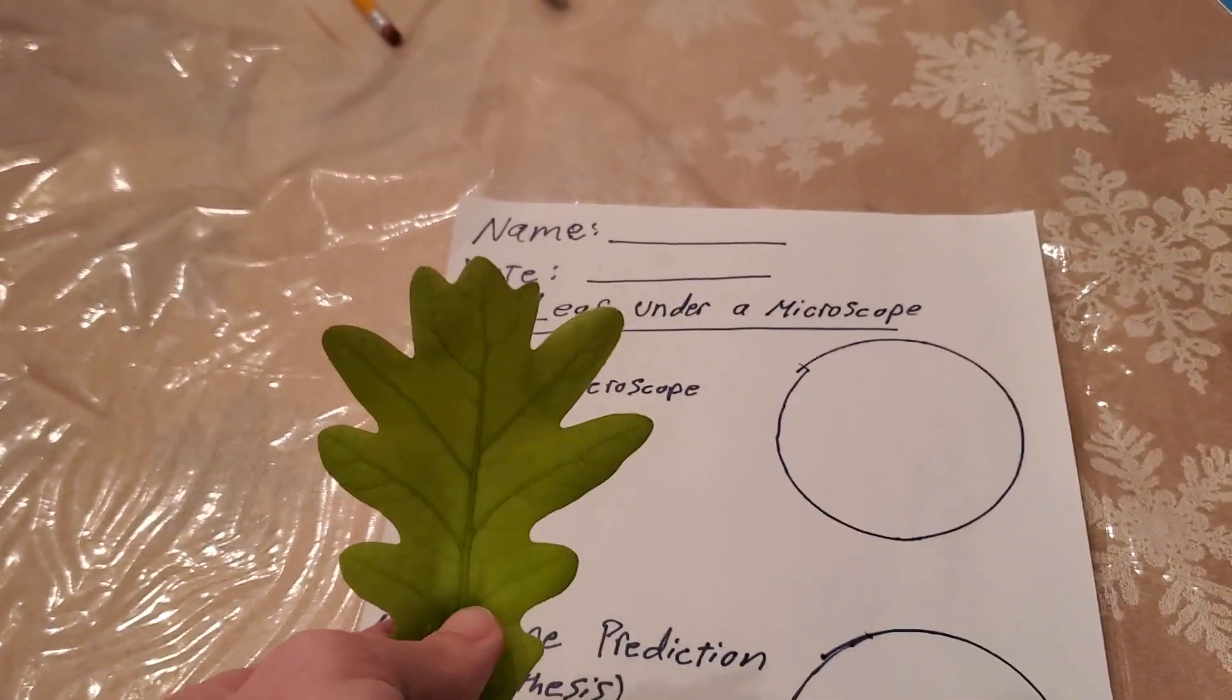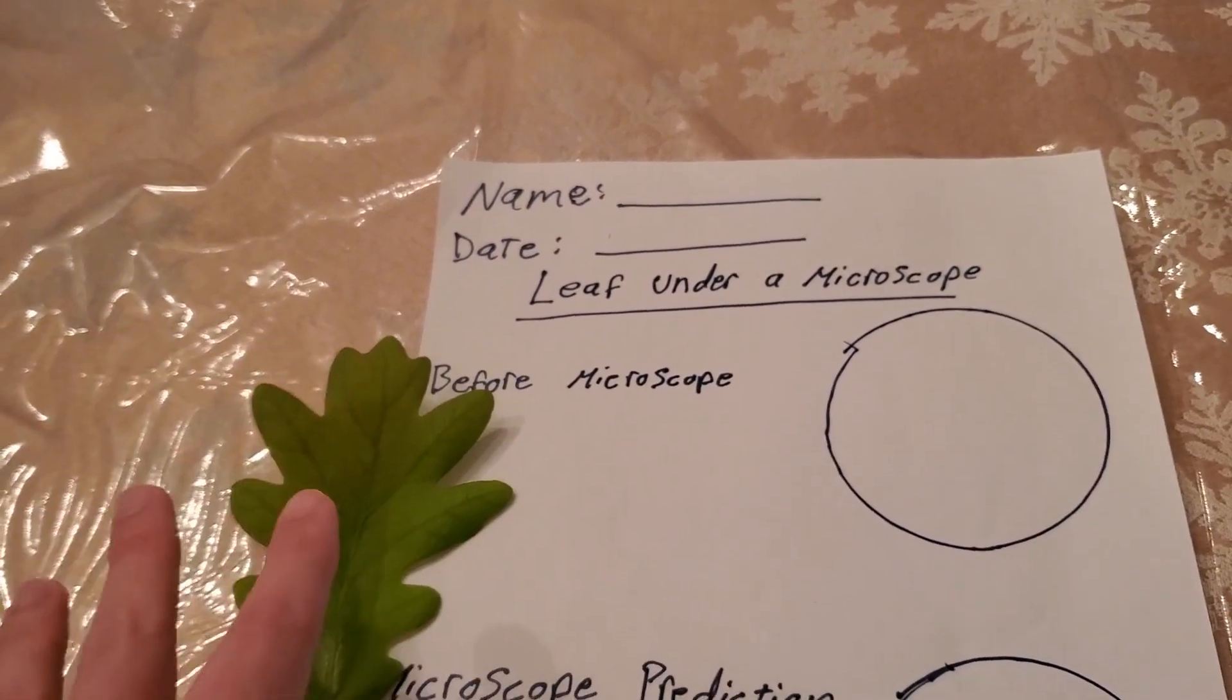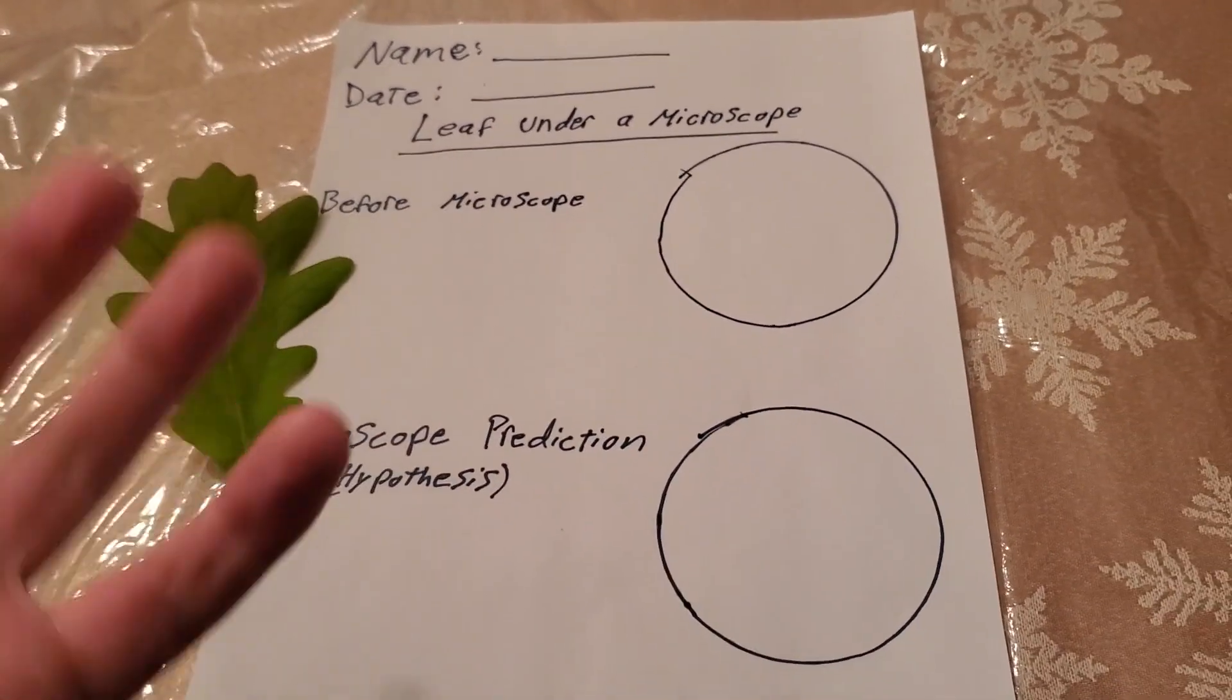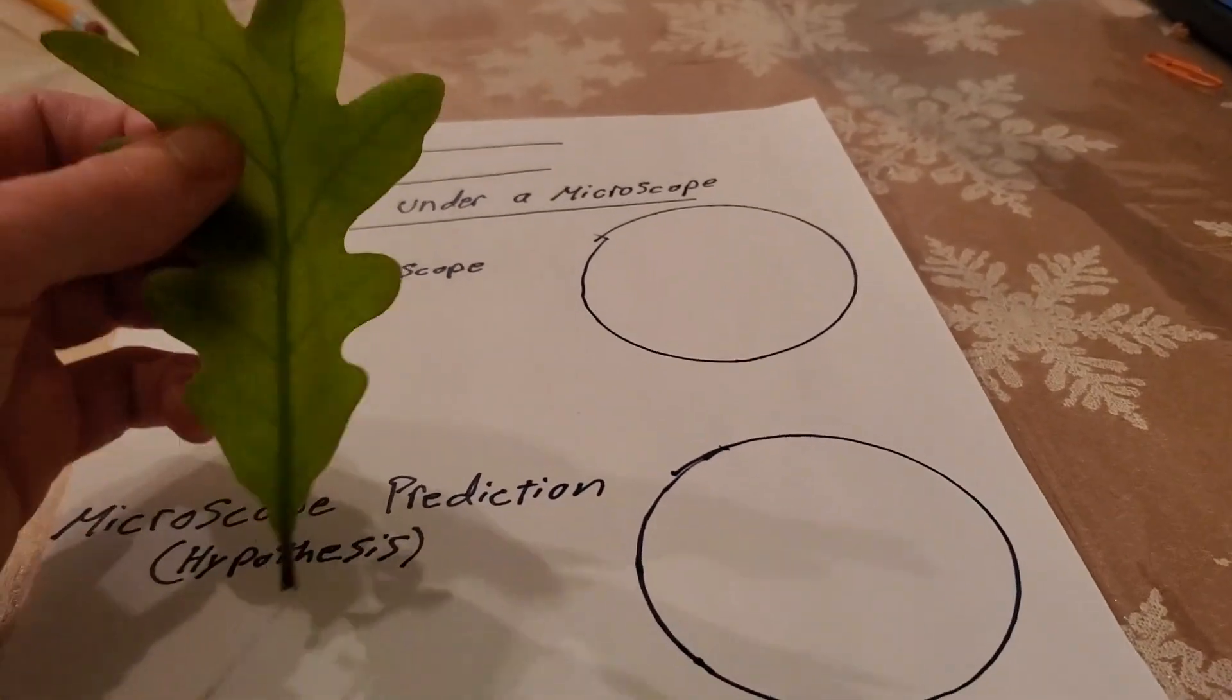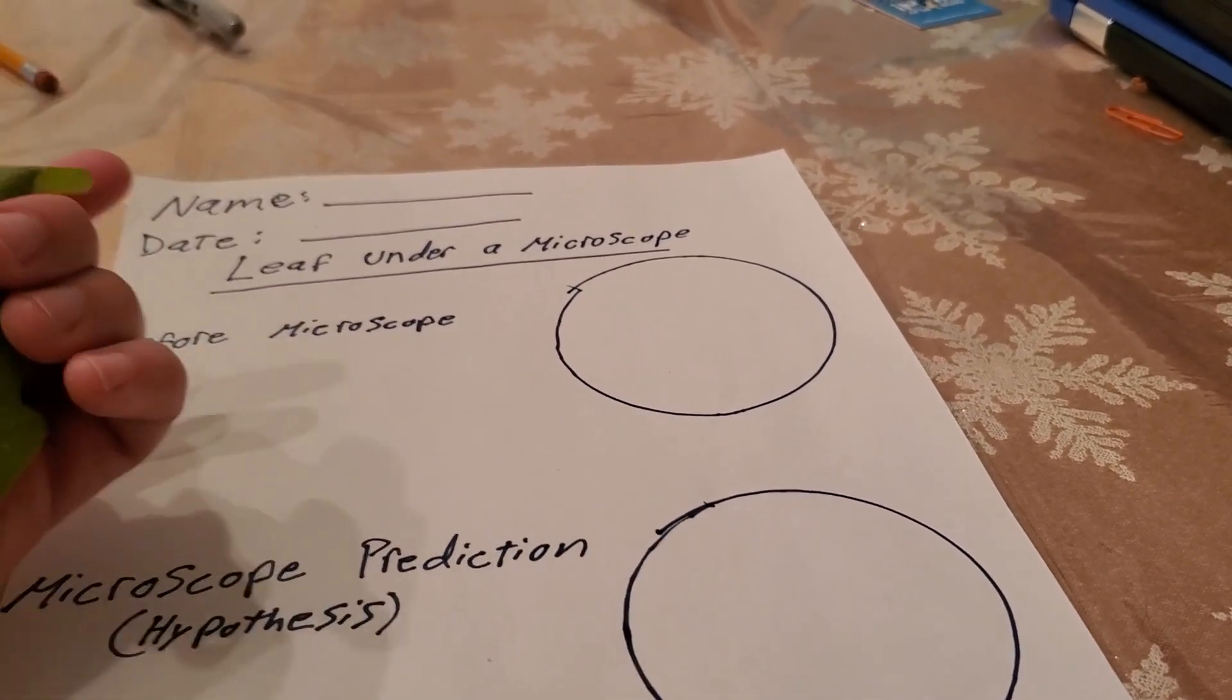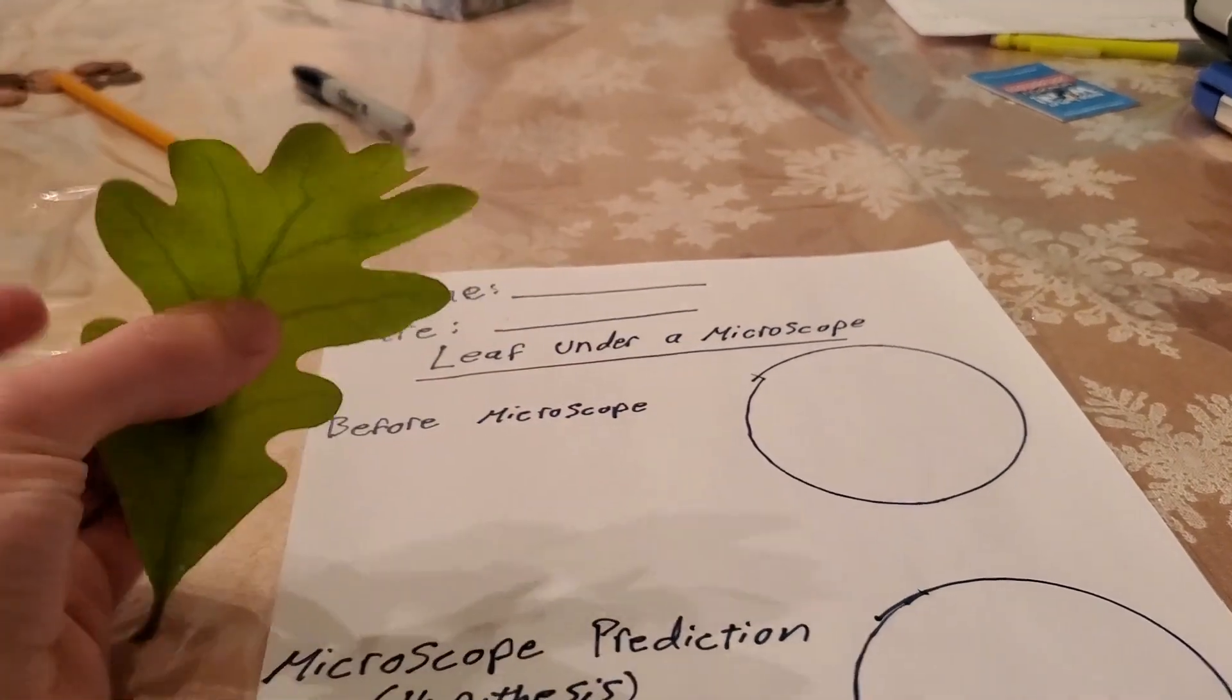So here's the leaf far away. Here's it really close to my phone. But just remember a microscope makes things, it zooms even more than what I was able to do right then. A microscope is super super cool. And so it's going to zoom in a lot, way more than we just could. And we might see some surprising new things we didn't know existed in there. I'm so excited.